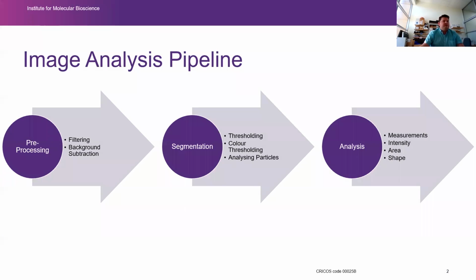So when we do image analysis, one of the overarching things is that the images you take can be quite pretty pictures, but the ones that you do the analysis on usually undergo a fair bit of massaging. So you undergo pre-processing in this pipeline, and then you want to segment and analyze on these segmented ones. What do I mean by that?